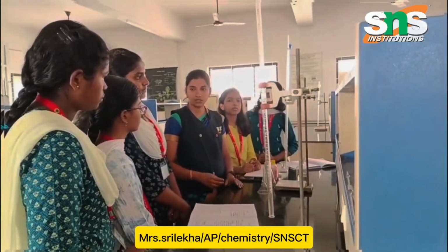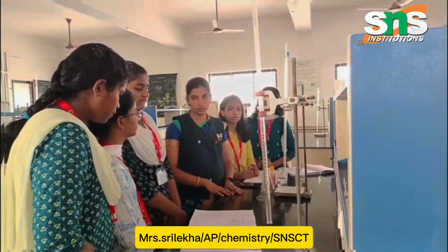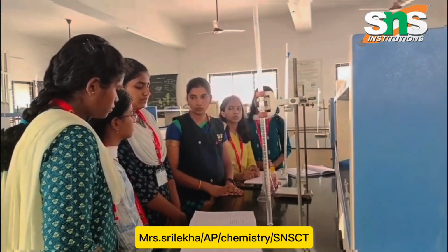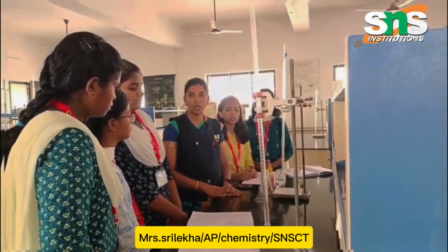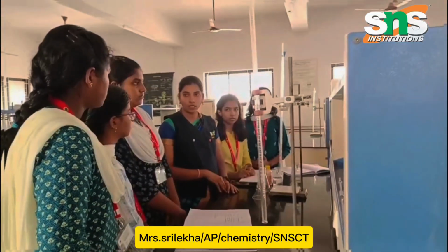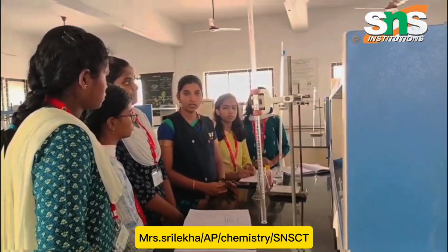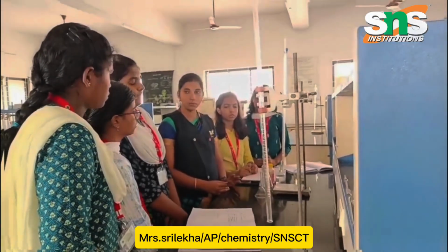What temperature are we maintaining for this experiment? Room temperature. At 30 degrees Celsius, we maintain it through titration 1 and titration 2 of this experiment. Are we using any additional solution? No, we are not using any additional solution. We are adding only the reagents, phenolphthalein and methyl orange.